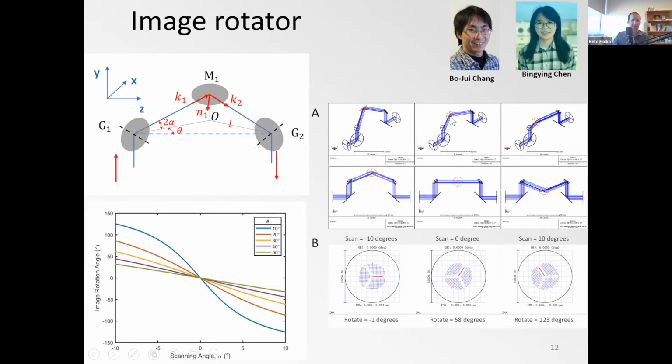And with the Galvos, you select which one you go to. We also added 2 additional mirrors to make this collinear, propagating in and out along the same axis. They're not necessarily needed. You could also come in from below, bounce off, and go back out, essentially taking a U-turn with your light.